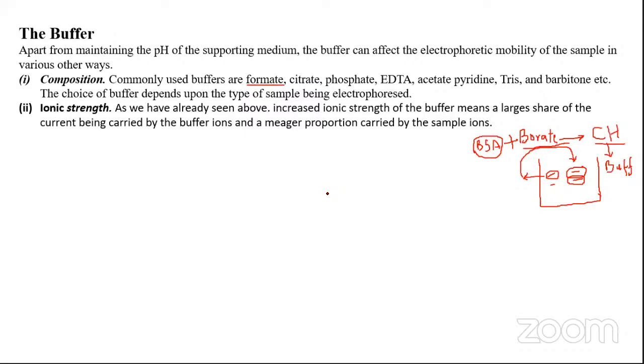Three, you should also consider the ionic strength of the buffer to be an important factor while choosing the buffer. Those buffers which can bring about good buffering even at low ionic strength work well during electrophoresis. However, those buffers which can work only at higher ionic strength cannot work well during electrophoresis. What do you think? Why? What could be the reason for this?